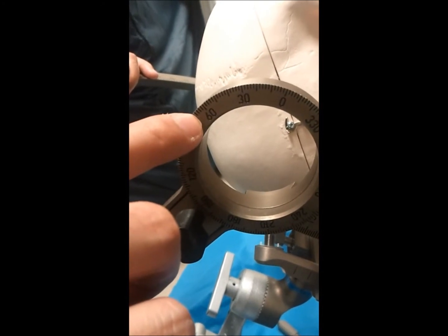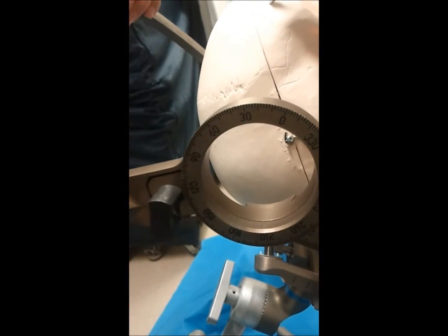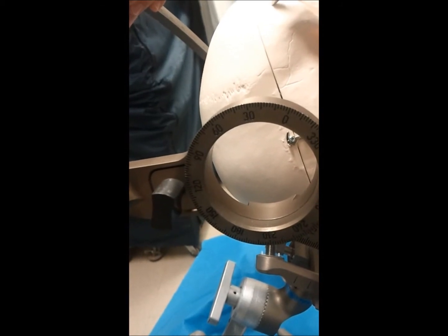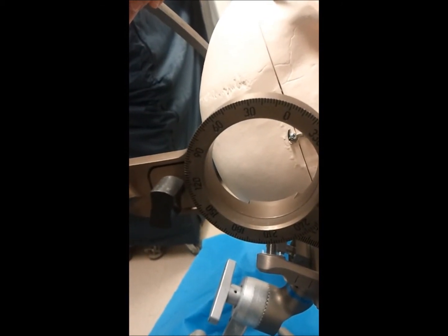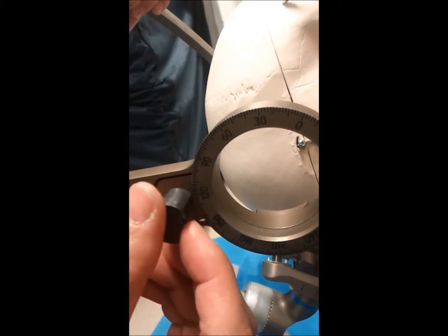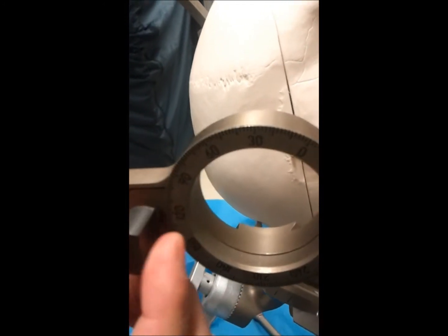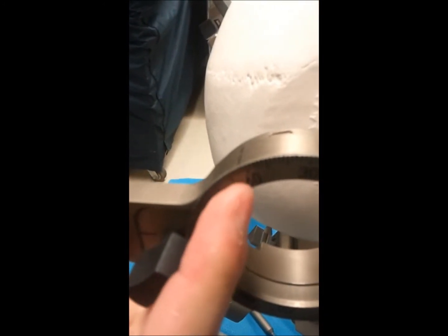You only have 2 degree difference markers here. So if you needed 61, you'd have to split the difference there. Obviously, if you needed an even number like 62, that'd be fine. But if you needed 61 or 63, you'd have to go in between and lock that in. Now, there's only a marker on one side of the ring, so it's very important you check that.